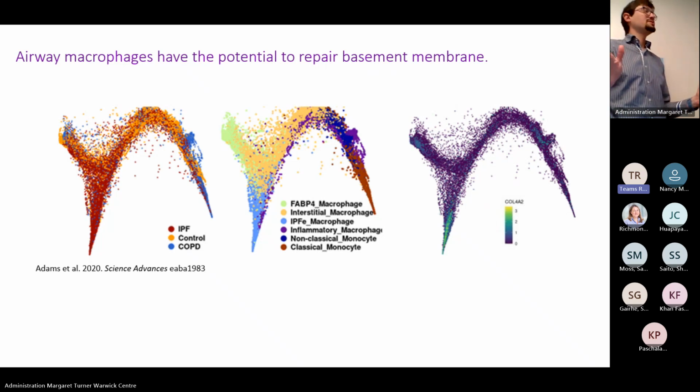And now it's actually getting so good that we're also, I didn't show this either, using laser capture microdissection to enrich for different parts of the tissue. So for basement membrane, we're enriching for basement membrane in skin, and that's working very well with PLF. We don't need a whole chunk of lung to do this kind of work. Now all we need is tissue sections, and we're able to get a decent profile of some of the most abundant proteins.